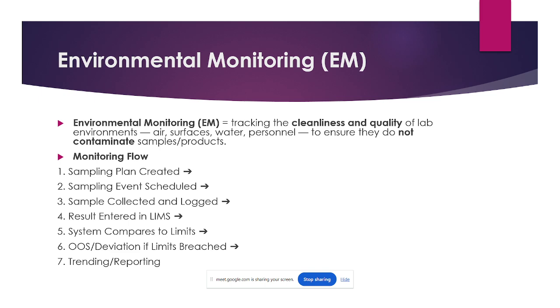Then you need to compare those results, as every day you have to check whether the results are within the acceptance criteria or not. After that, OOS and deviation. If any OOS or deviation happens, then we go to the quality assurance module and log the OOS and OOT. We can log it, or otherwise it will log automatically. So we can see the OOS number and all in the LIMS only. Then we can follow the further procedure in the LIMS application.